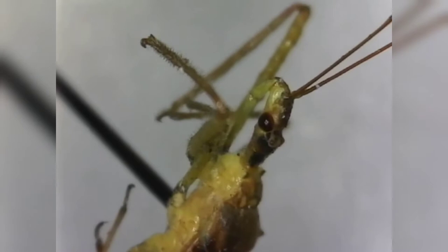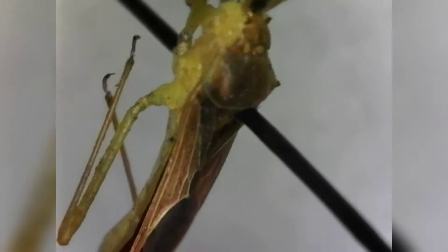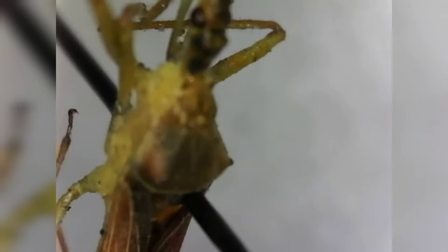Right there you can see the ocelli — clear as day, right behind the eyes: a little circle right there is the ocellus. With that we move on to couplet 15, which asks if the middle and hind tarsi are one or two segmented, or if they are three segmented.